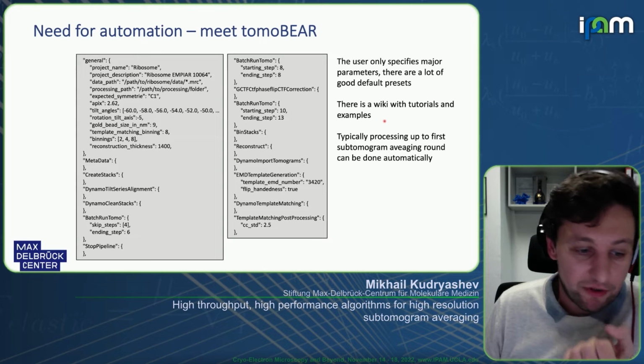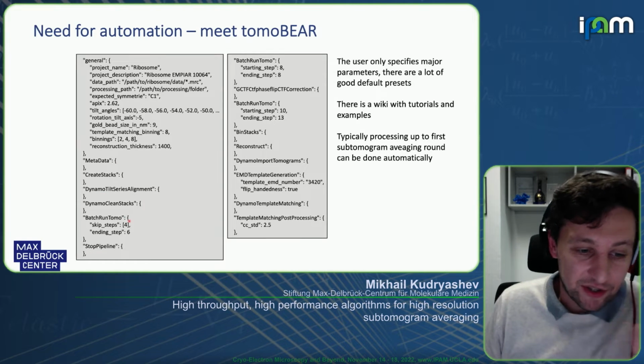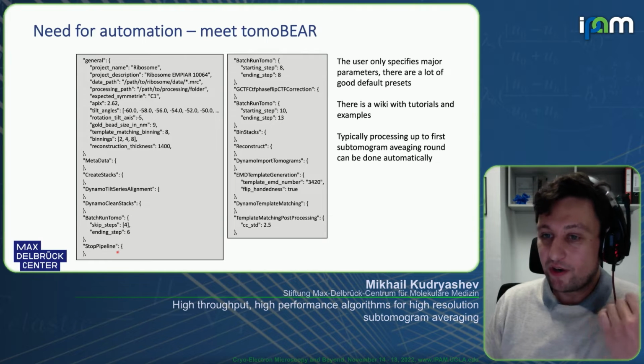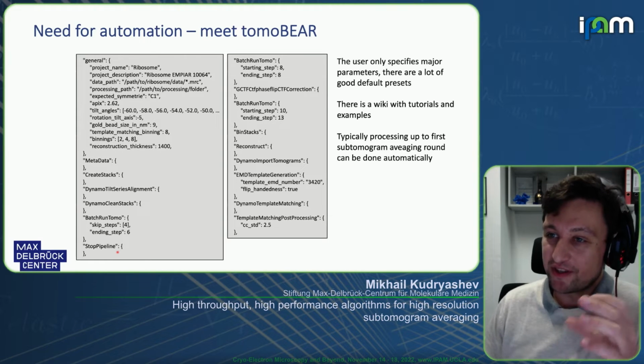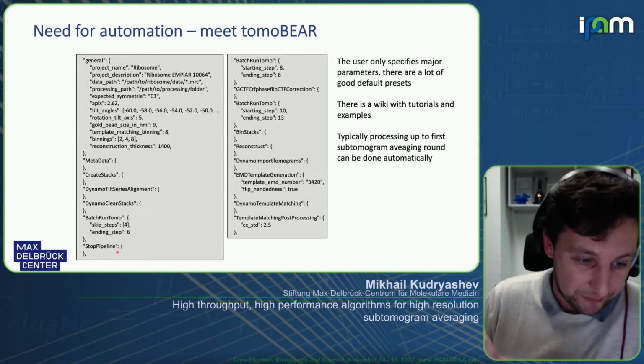So in this example, for example, it runs up to a tilt series alignment with Dynamo, and then it converts them to an IMOD project. So we have the parallel IMOD project because I think that people are very used to IMOD, and this includes people in my group.